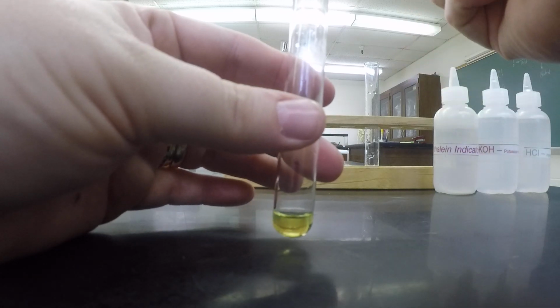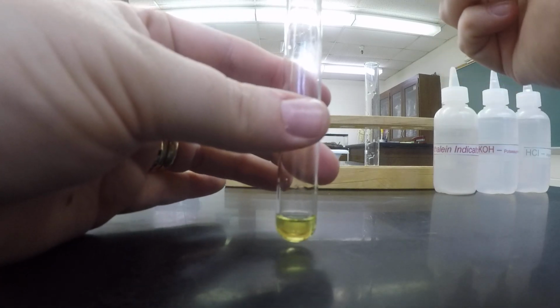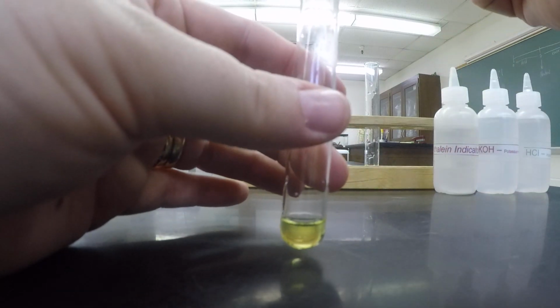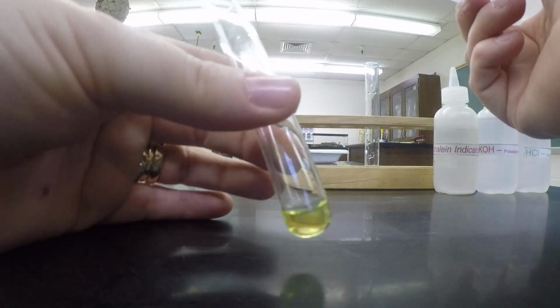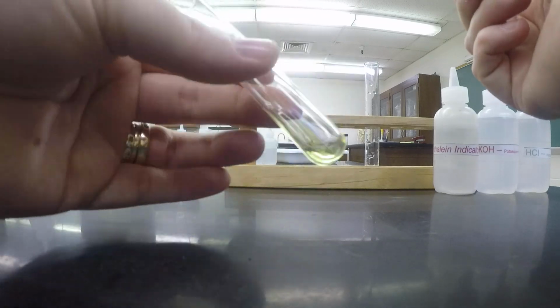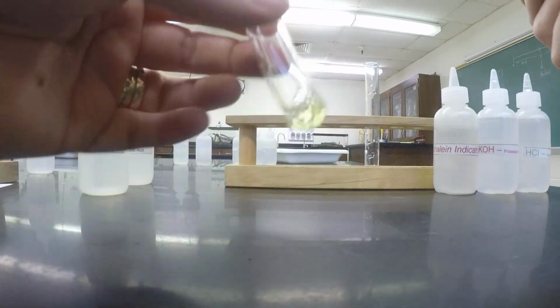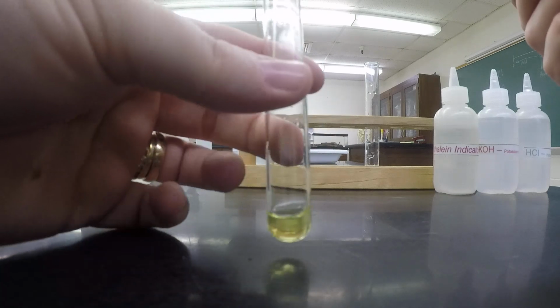So I'm going to add 1 drop, mix it, it didn't change. I'm going to add another drop, mix it, still didn't change. Okay, here's my 3rd drop. Not really. Here's 4 drops. A little bit. Here is 5. A little bit.